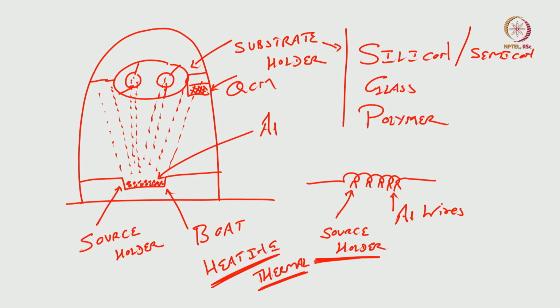QCM stands for quartz crystal monitor. The quartz crystal is used to monitor the rate of deposition of the metal onto the substrate loaded onto the substrate holder.